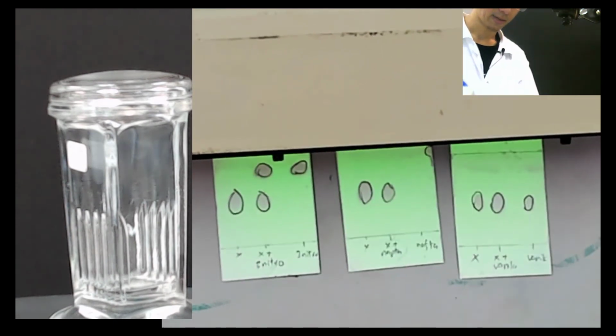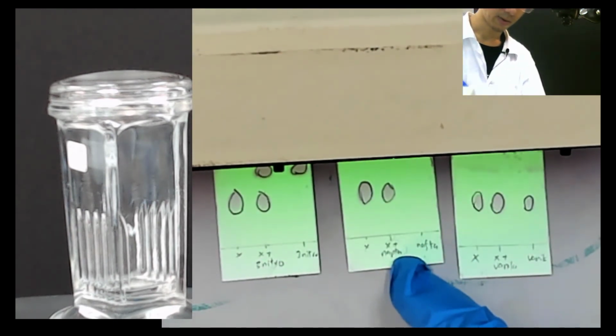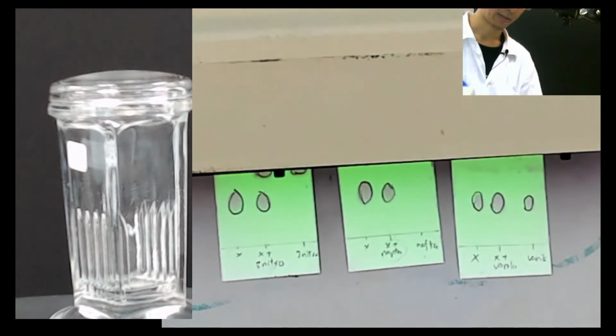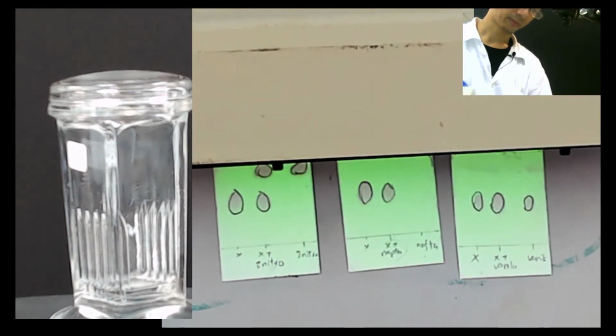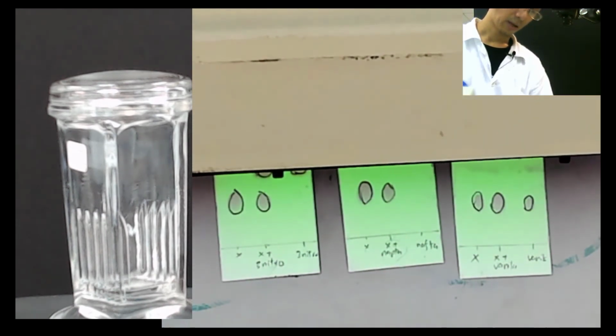Why are there no naphthalene spots in the middle? So this is no Sarah. Sarah, okay. I think it's because the spot is too big for naphthalene, or either or. And because of that, the mixing is not correct.